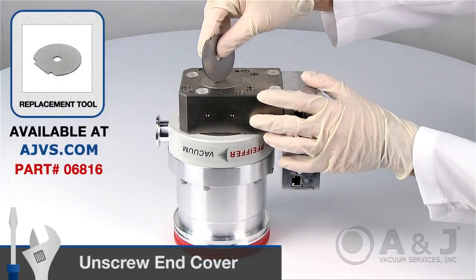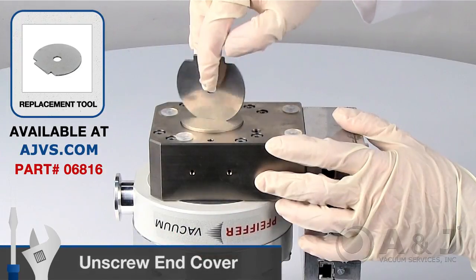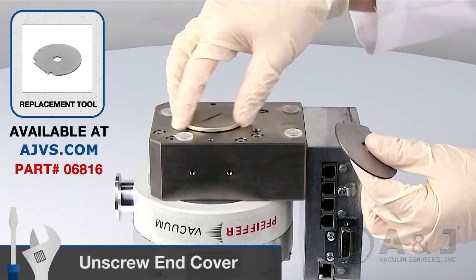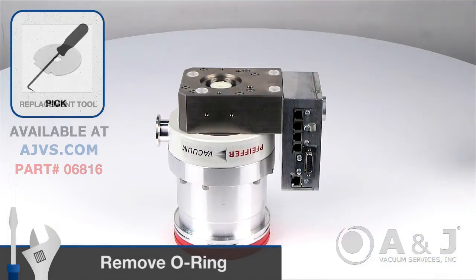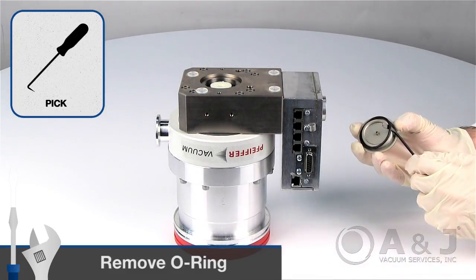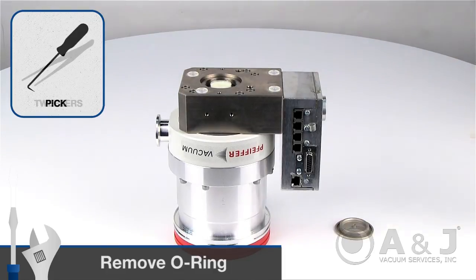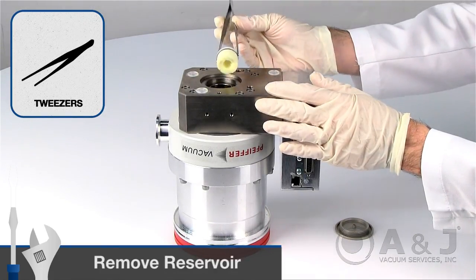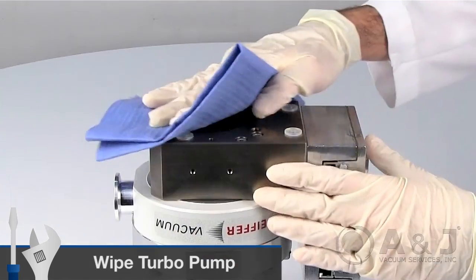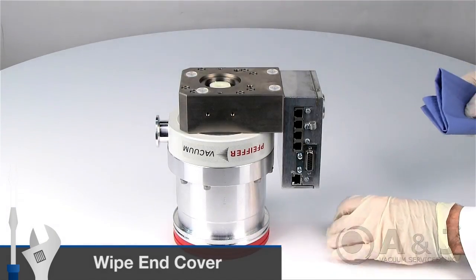To begin, unscrew the locking cover on the underside of the turbopump with the Pfeiffer Reservoir Replacement Tool. Remove the old O-ring from the locking cover with a pick tool or screwdriver. Lift out the operating fluid reservoir with a pair of tweezers or similar tools. Clean off any dirt on the turbopump and locking cover with a clean lint-free cloth.